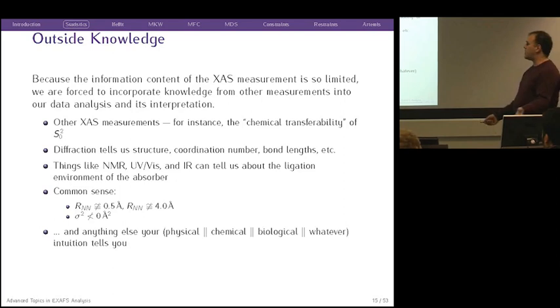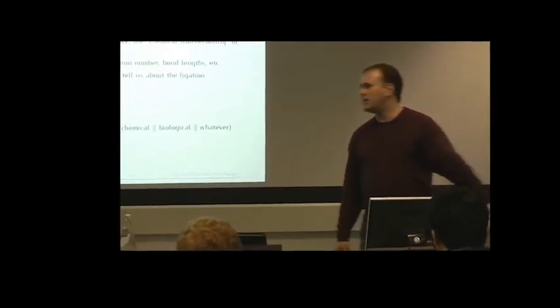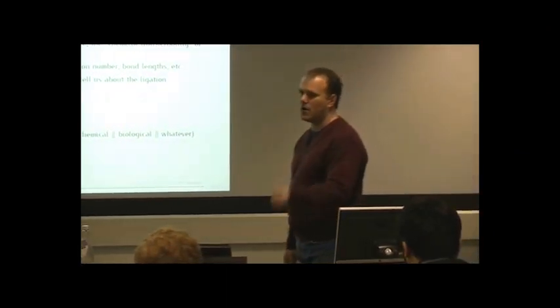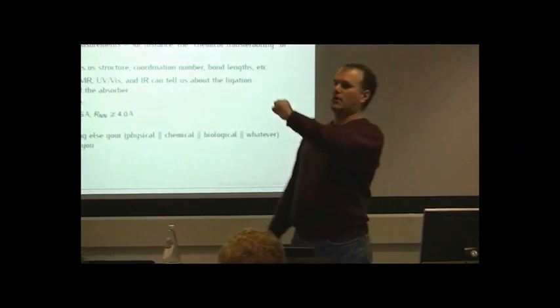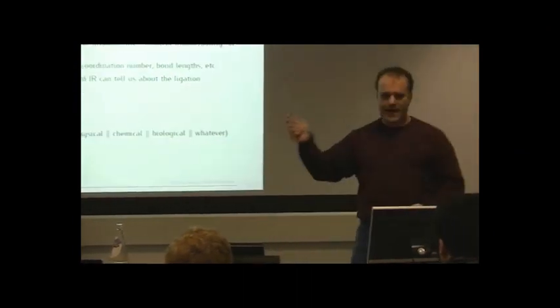You are the expert in the thing that you're working on. You have a physical or chemical or biological or geological or whatever logical intuition about what your sample is, and you should bring that to the table when you're doing x-ray analysis.